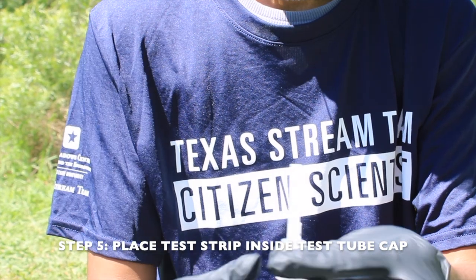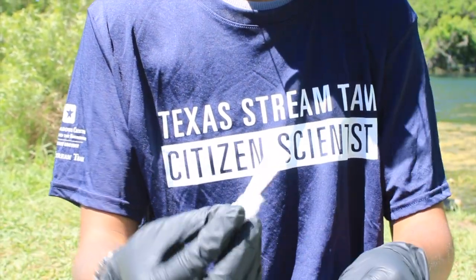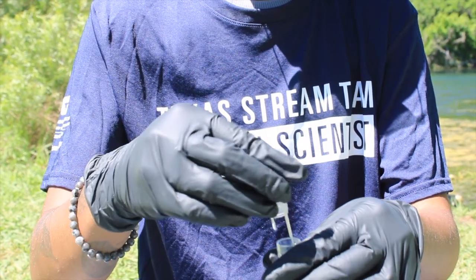For step 5, place the bend of the strip inside the test tube cap. Cap the test tube with the strip inside.